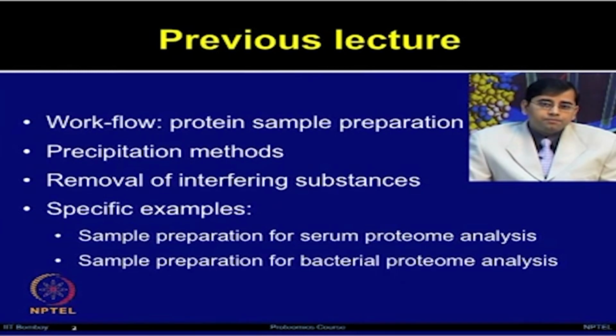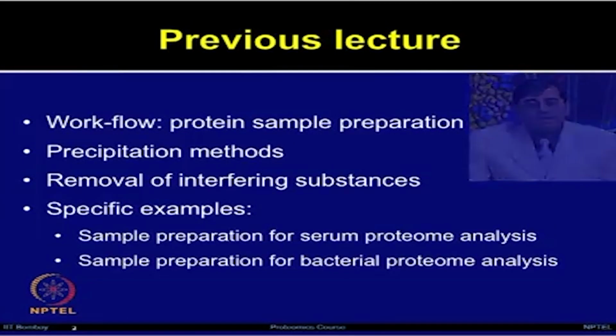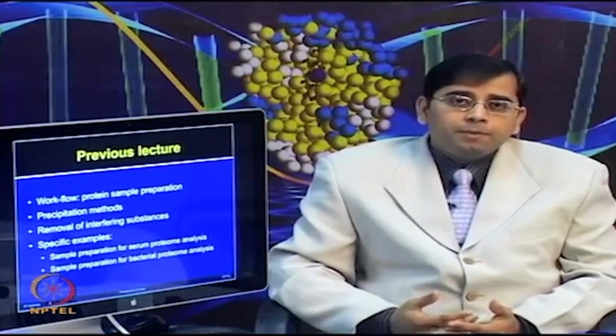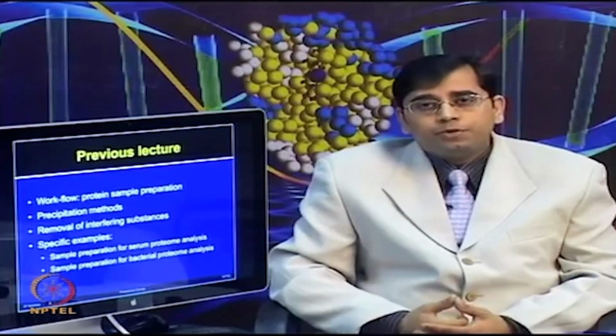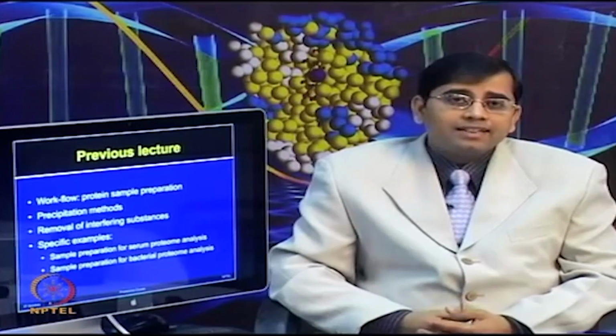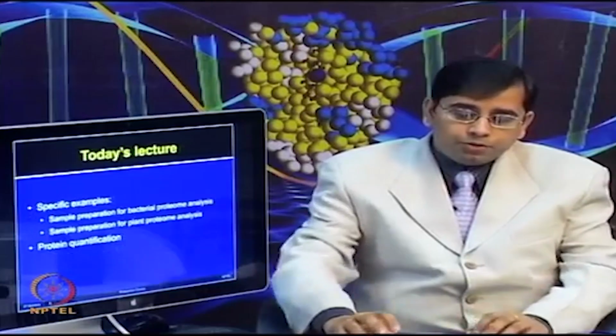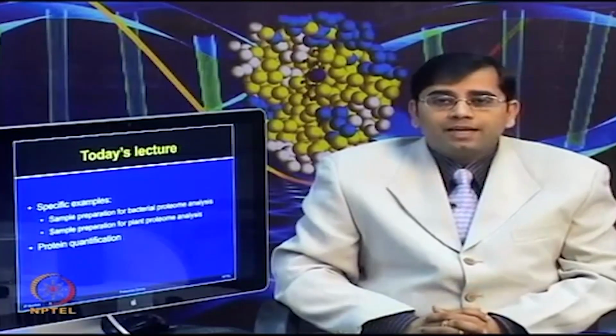then in the last lecture, I started talking about specific examples. First, we discussed how to analyze serum proteome, how to prepare the sample for serum protein analysis, and then we moved on from serum to bacteria and started discussing sample preparation strategies for bacterial proteome analysis. In the last lecture, I stopped there and today we are going to continue from the bacterial proteome analysis.